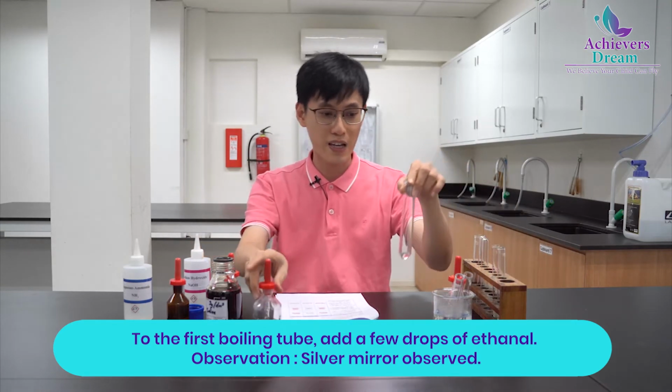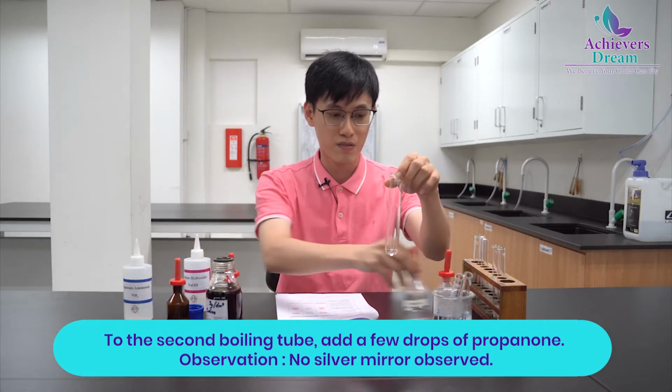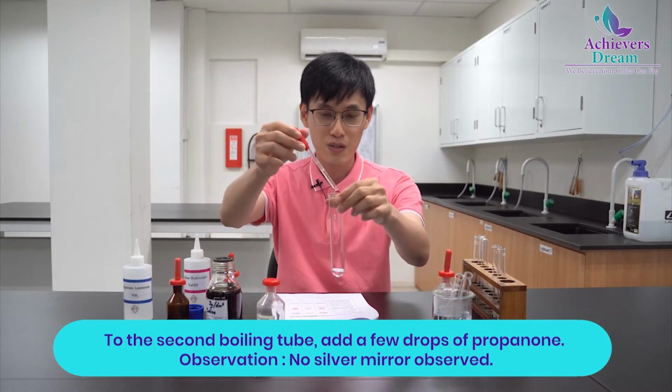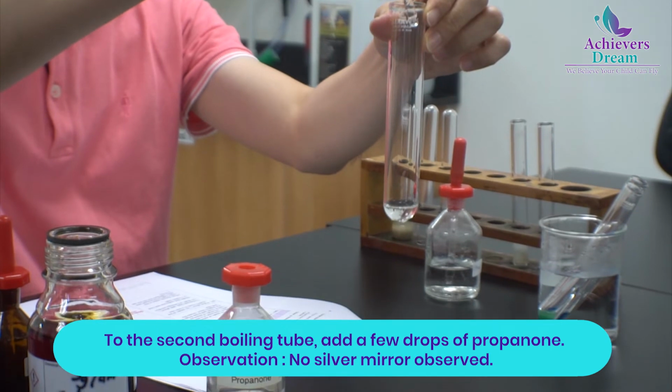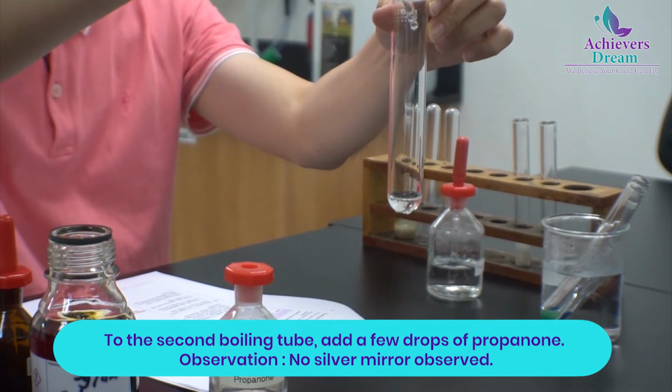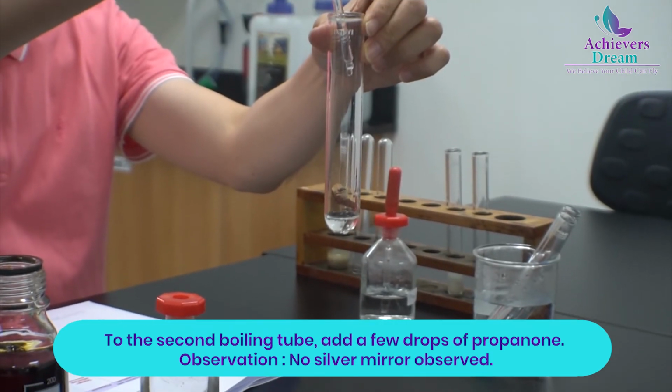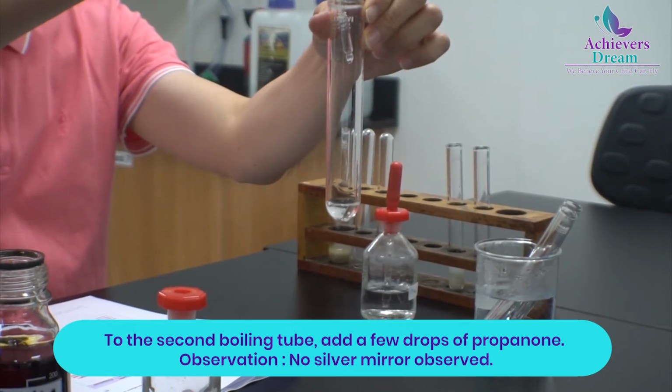Now let's try for propanone. Propanone is a ketone. Ketones can't be oxidized, so we do not expect to see any silver mirror at all. Nothing is happening. So some time has passed.